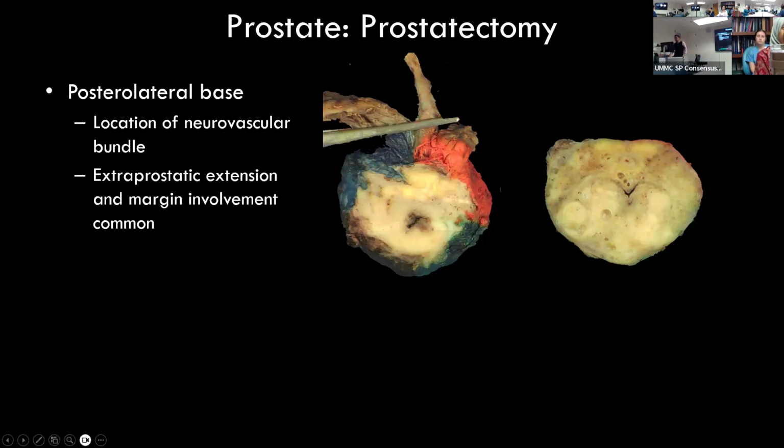Okay, so if you identify cancer macroscopically, so you can say that this area is homogeneous, slightly yellowish, that's probably cancer, probably this is cancer, this is cancer.